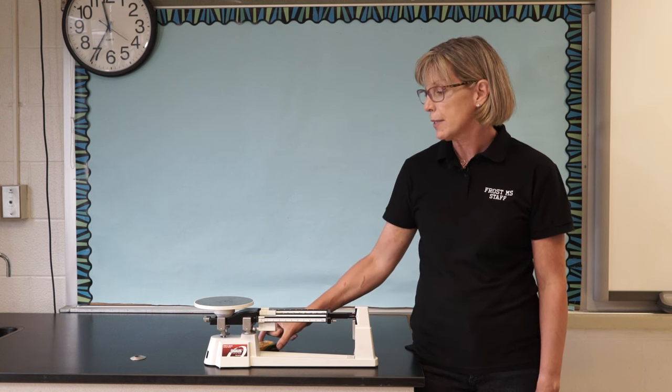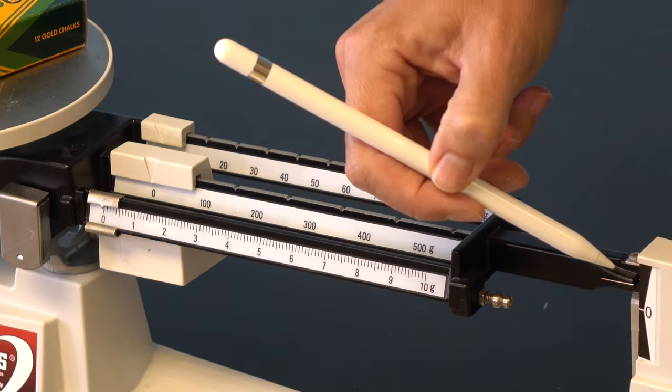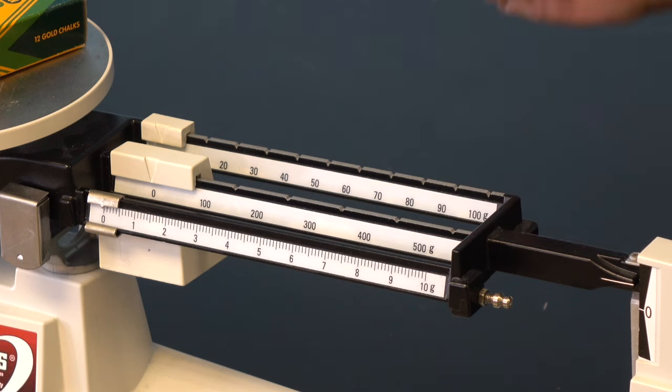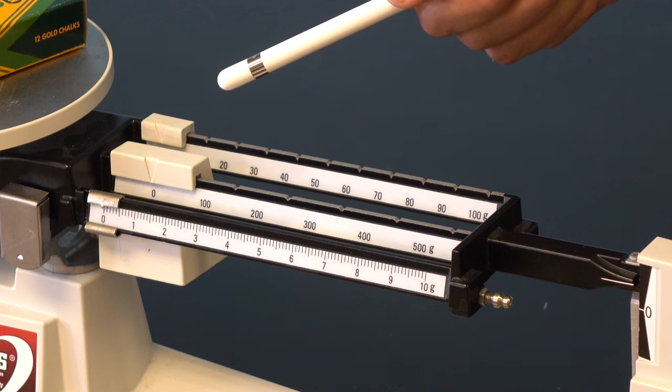Next, we place the object to be massed onto the pan. You'll notice that the pointer rises and goes above zero. That's because the mass on the pan is greater than the mass added together on all three beams with the riders in this position.